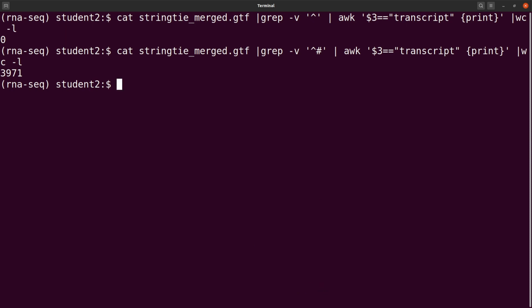Okay, so let's continue. Another thing we can do is to compare the list of genes and transcripts that have been assembled, that have been identified, to what is present in the reference annotation file. To do that, we use the tool called gffcompare. So we say gffcompare -r to specify the reference, which is resources chrx.gtf.